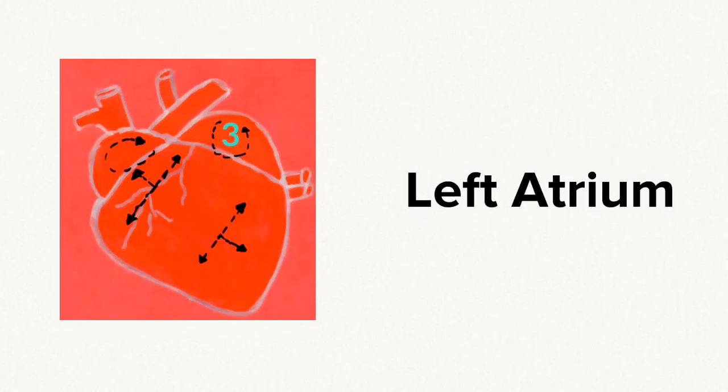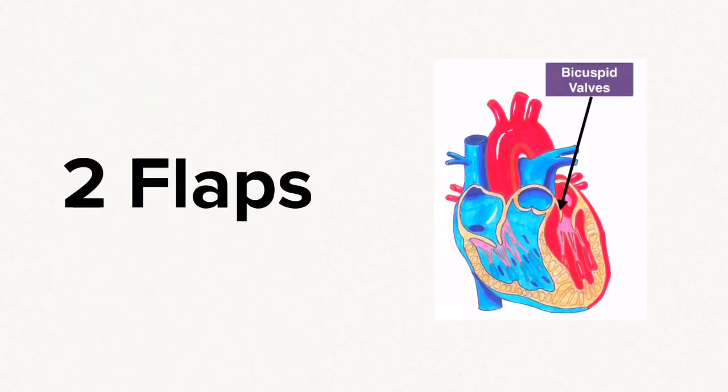Cut number three was into the left atrium. You noted how small the left atrium was and you also noted the two flaps of the bicuspid valves.